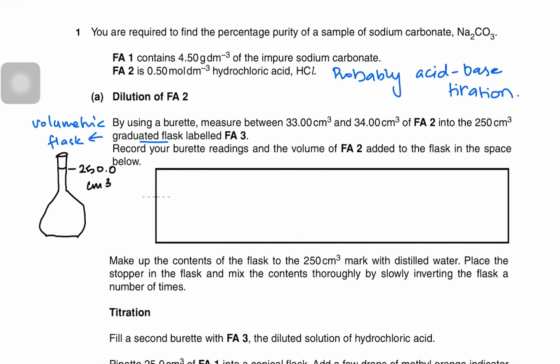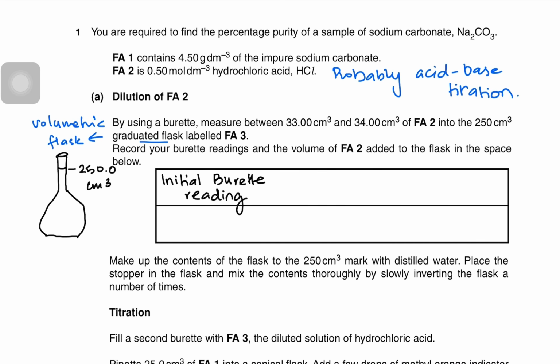I'll show you important headings to be written here. The first heading should be initial burette reading. You can't write them in short form. You can't write IN burette reading. IN to signify initial will not be accepted. Make sure to write a slash and centimeter cube.